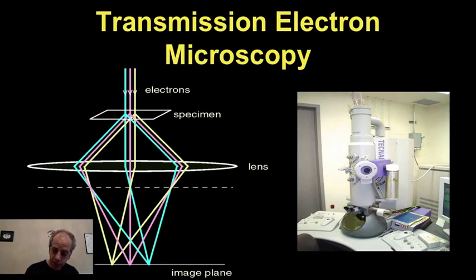This is a picture of this device. The high-end devices are not very cheap. They can cost millions of dollars. So this is not something that you carry with you like a regular digital camera. Once again, the issue is electrons are hitting the specimen basically, and then they go through and we capture them. So for us, it's a different way of creating images, but the important point is that we can create images for these particles that are very, very small.